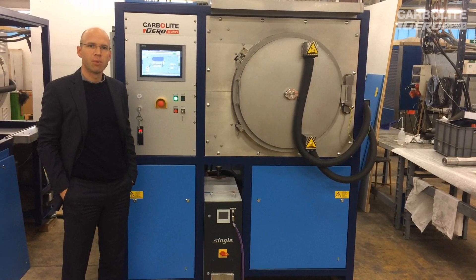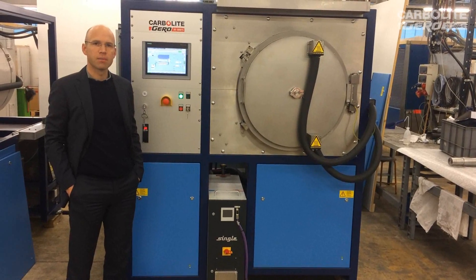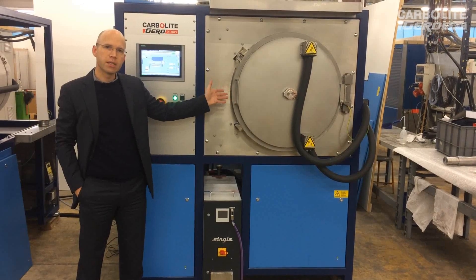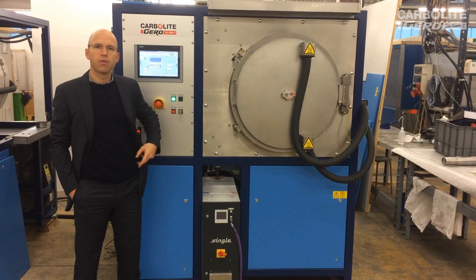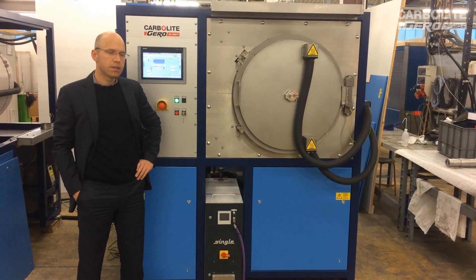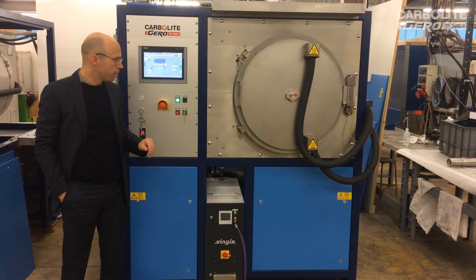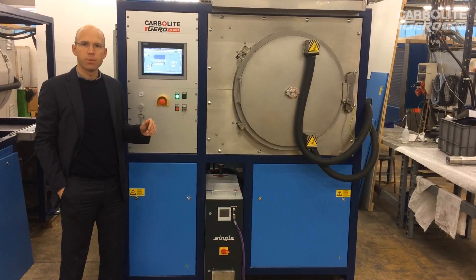The workability is the most important thing, and this EBO has clearly shown at the customer site that it can run for more than 10 years, because this furnace is a replacement of an existing version. That existing EBO at the customer site has been running for more than 10 years and is still working. We take the old unit back, replace it with the modern software and modern touch panel — and it's not just one unit, but two units we deliver to the customer next week.